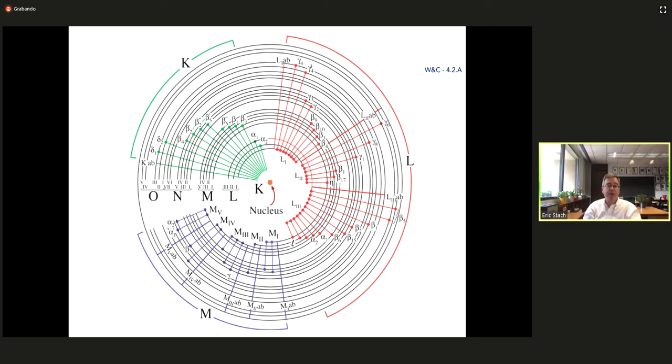So in answer to your question, Anthony, one of the reasons to use the 2100 or the Talos is because they're so versatile. You can do diffraction, diffraction contrast, phase contrast, STEM, EDS, and EELS, and that's great. But what you might find is at the end of your session, you think to yourself, shoot, I wish I had a bit better resolution in the high-angle annular dark field. And so what you do is you take your sample out and you walk over to the other microscope where you have to spend more time to get that extra little bit of capability, but you can do it readily. So again, hopefully that answers the question.